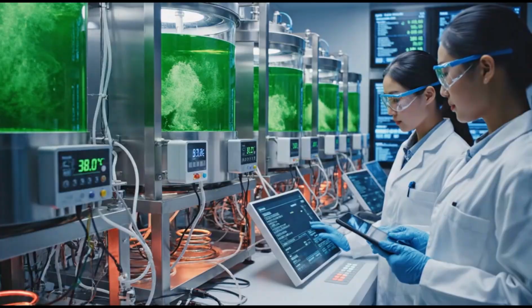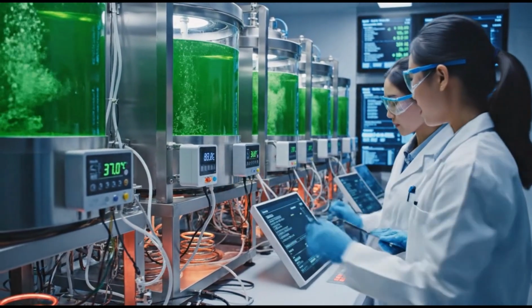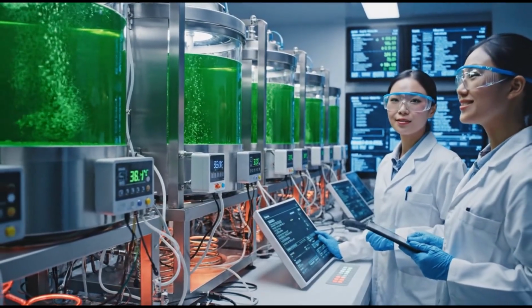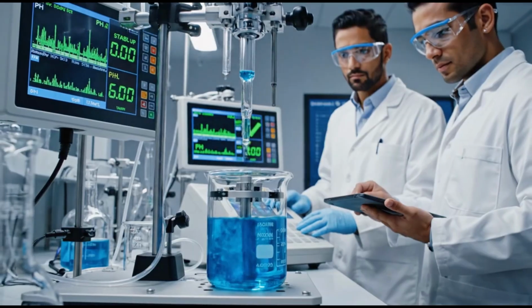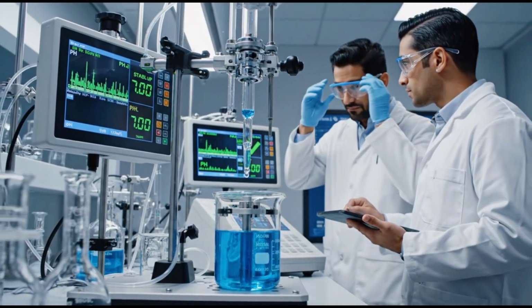Automated agitators and heating elements are maintaining optimal conditions. Confirmed. Sensor readings are perfectly stable. The levels are stable. We have approval. Recording the data now.